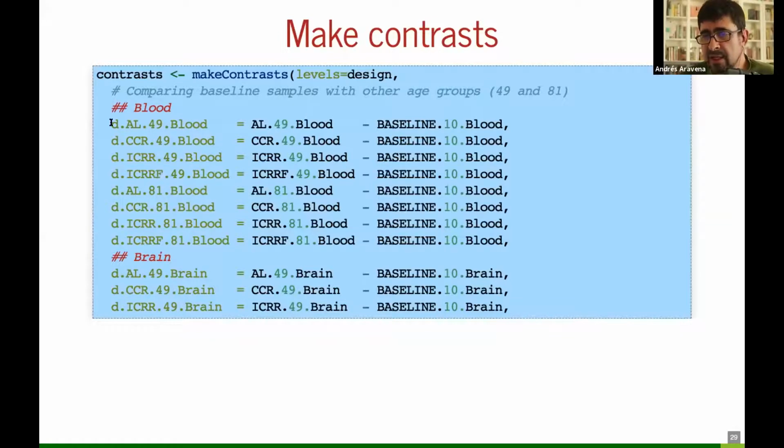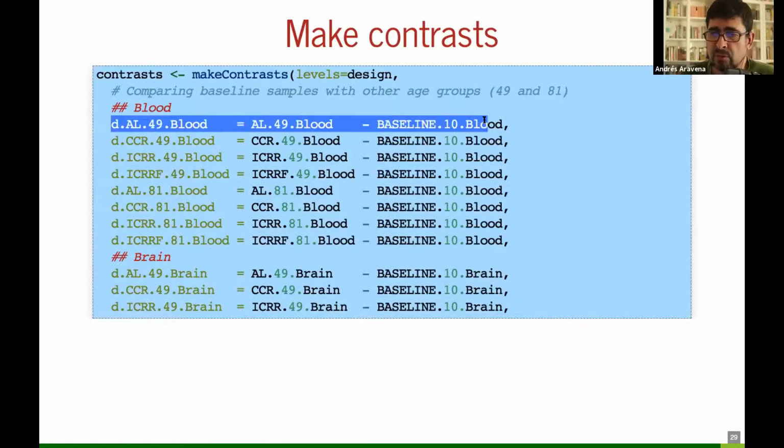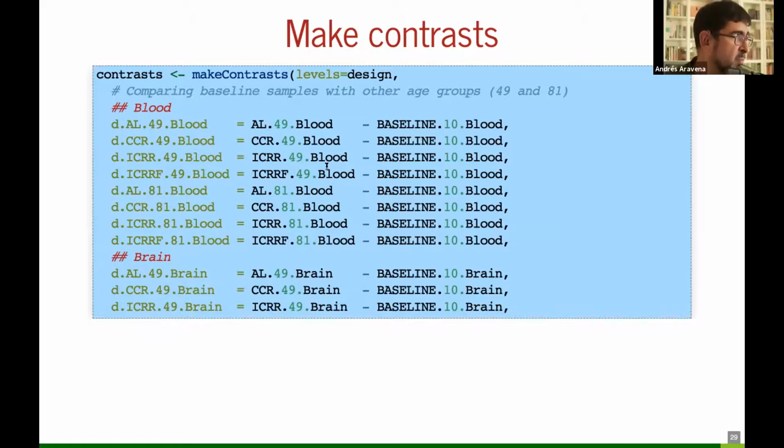And here the meaning is like, what is the change of expression versus, I'm sorry, there is even another point that we have different source of noise, different source of error. And as I say, it is not obvious that the concentration, that the light intensity, the luminescence that you measure in the microarray, they are not obviously connected to gene expression. But the difference does. Because if there is anything affecting this part, will also affect this part. And when you compare them, all that noise cancel each other.